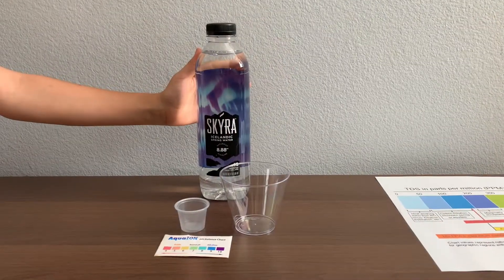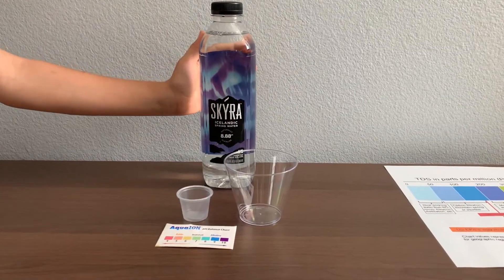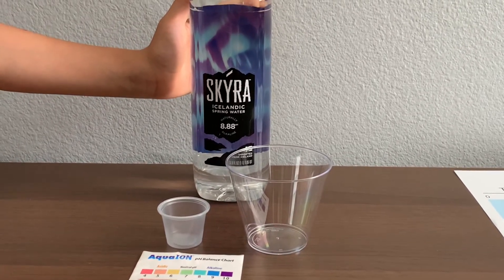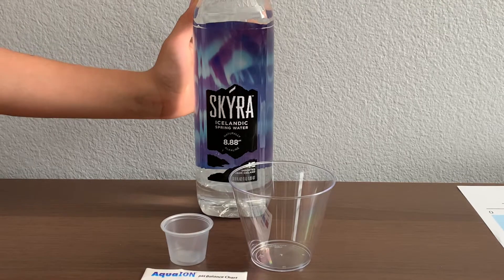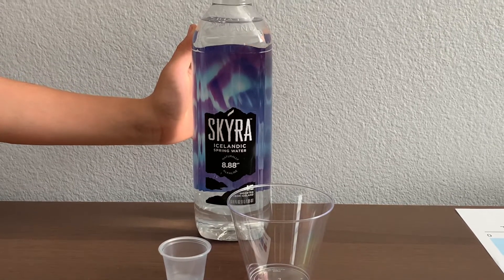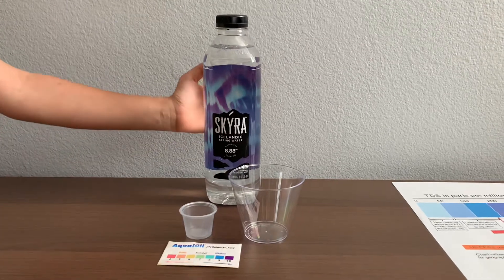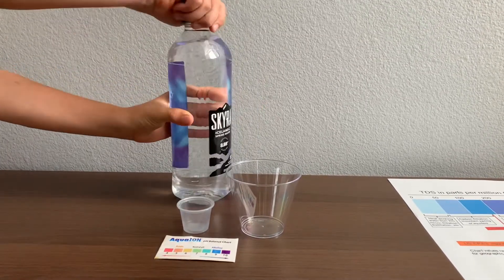This is Skyra Icelandic naturally alkaline spring water. The pH balance in this water is supposed to be 8.8. It is imported from Iceland and sold at $7.11 for $2.69. Let's test the pH and TDS levels.